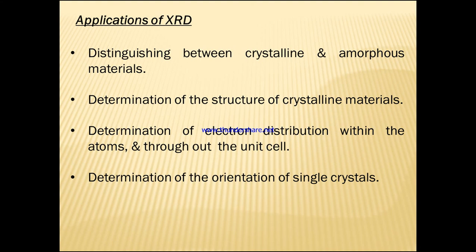In our next session we will discuss the different types of techniques, in relation to all we have seen in the last session. The optical microscope, scanning electron microscope, transmission electron microscope, and X-ray diffractometry are all contact type techniques which are used for the analysis. In our next session we will discuss the non-contact type of techniques which are used for the analysis of the material.